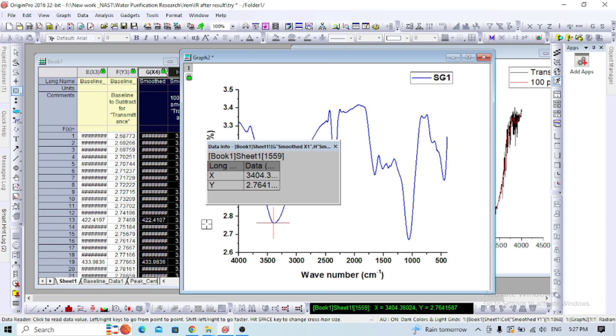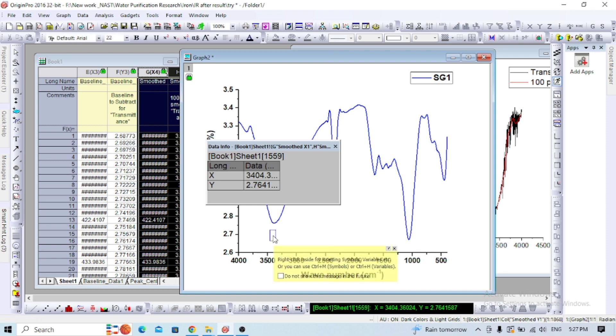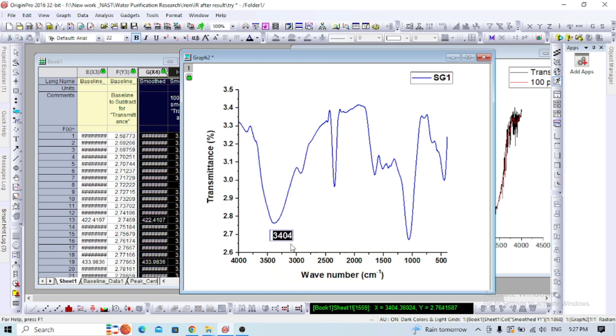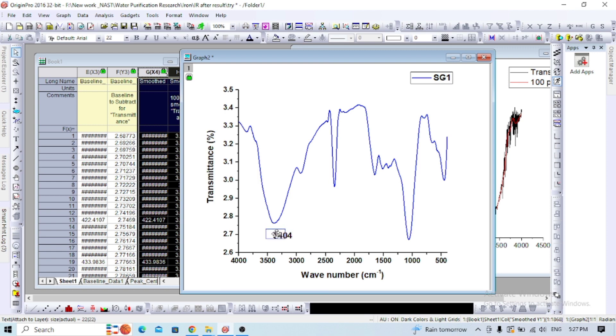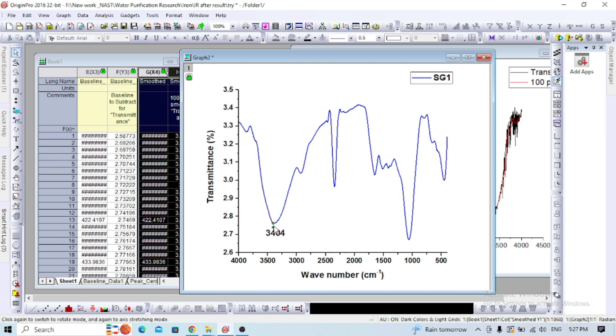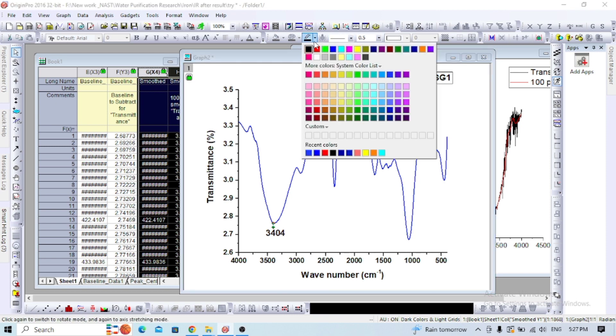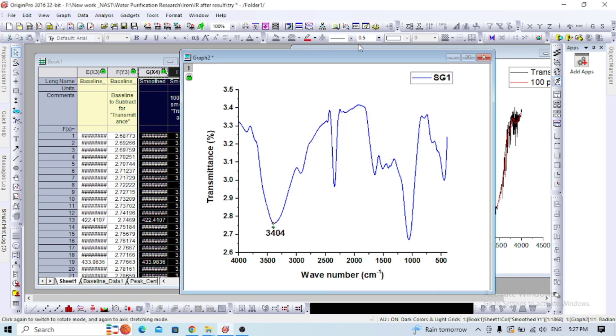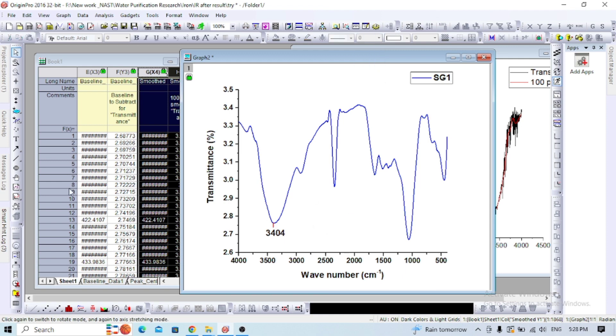Open a text file and write 3404. You can make it bold as well. You can also add a line and change its color to red for the annotation.